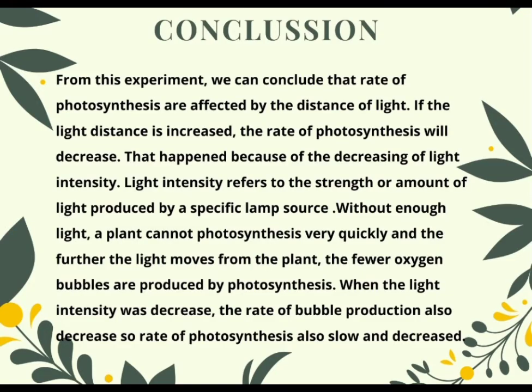The conclusion from this experiment is that we can conclude that the rate of photosynthesis is affected by the distance of light. If the light distance is increased, the rate of photosynthesis will decrease. That happens because of the decrease in light intensity.